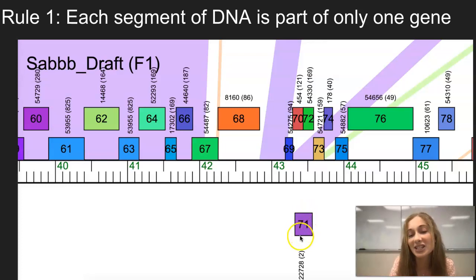If you look below each gene in the parentheses, this number indicates how many specific genes are in its FAM. So there are only two other phages within this FAM that call a similar sequence. This number is quite small as you can see from other genes compared to gene 60 that has 280 or gene 61 with 825. So since this number is pretty small, it's just more evidence in why gene 71 should be deleted.